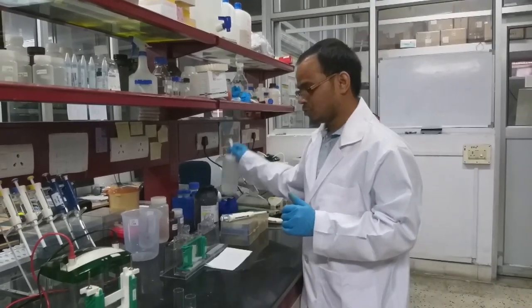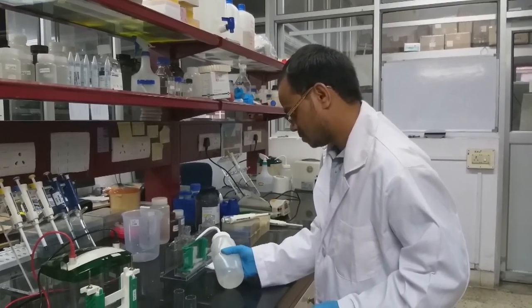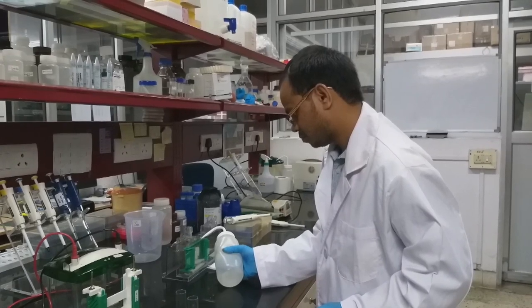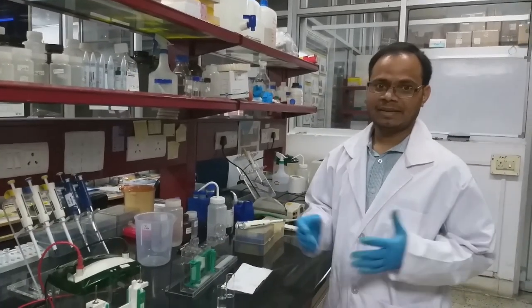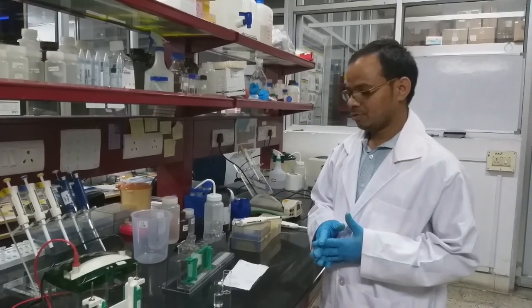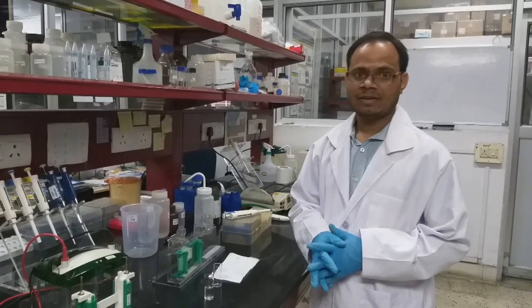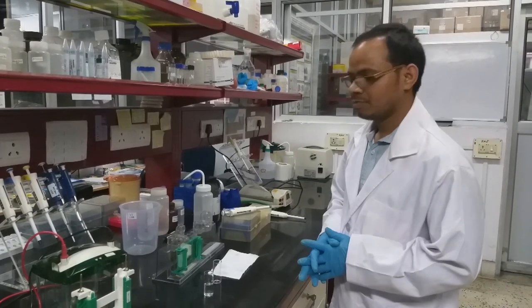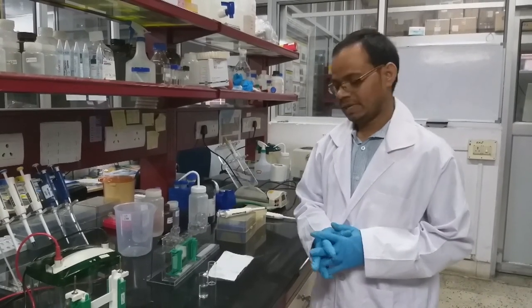So I'm going to use milky water. After checking the gel, is there any leakage or not? So we move forward to preparing the resolving gel. The composition is given in this slide. Please go through that slide.